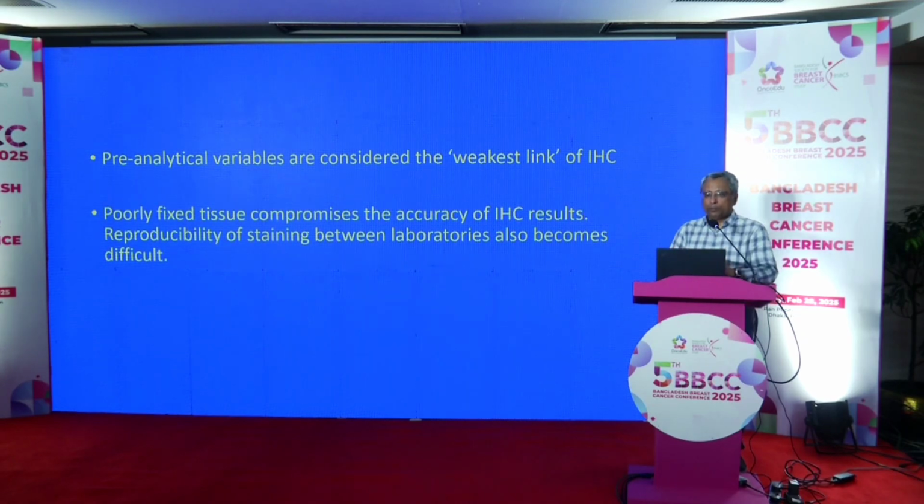And the other important thing is the fixation, right? Proper fixation is very important for immunostain, for H&E stain, for molecular assays also. So if you have a poorly fixed tissue, that means you can have poor protein expression, you can have poor RNA or DNA extraction. So that downstream affects all the tests that you do.